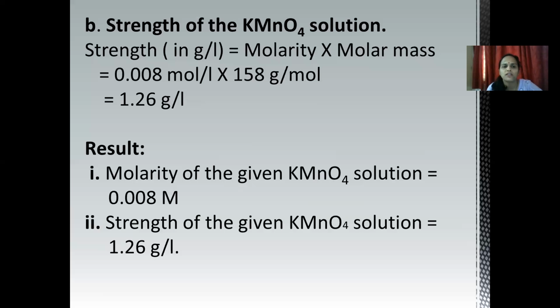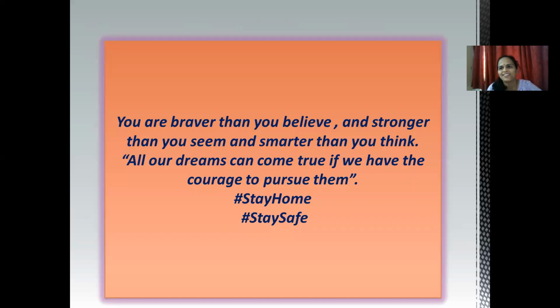We'll report the result at the last. The result is molarity of the given KMnO4 solution is equal to 0.008 molar, and strength of the given KMnO4 solution is equal to 1.26 grams per liter. So till here you will note down in your practical notebooks, and after the school reopens, we'll do the experiment on this.